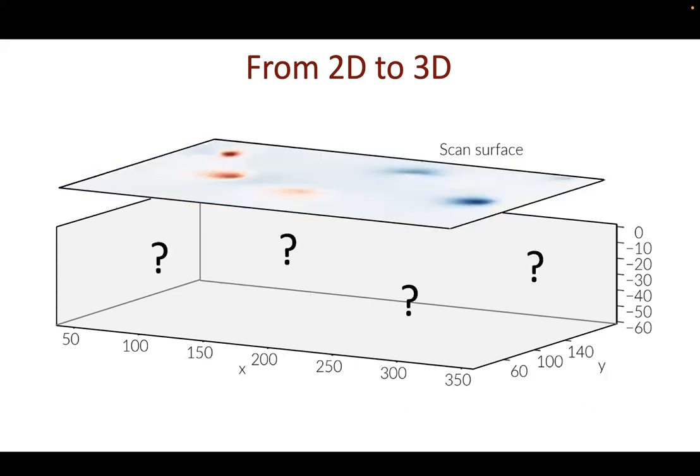But if we are looking at a more complex scan, and this one is not even that complex, but we have a couple of distinct anomalies, and above all, we don't have a clue about what is in our sample, in that case, your inversion is lost, and you cannot determine any information on the magnetizations of your grains in there. So what we need to do is tell the inversion where our magnetic sources are. That would greatly improve the inversion, or make the whole inversion basically unique.